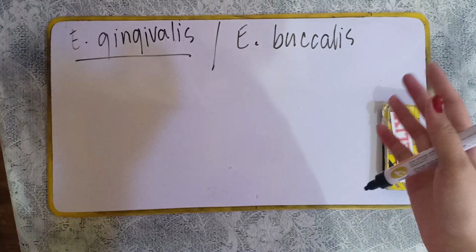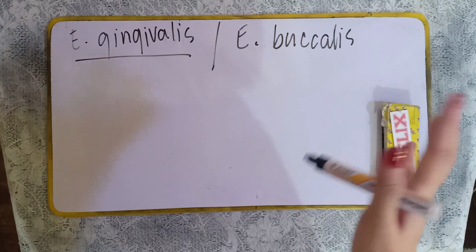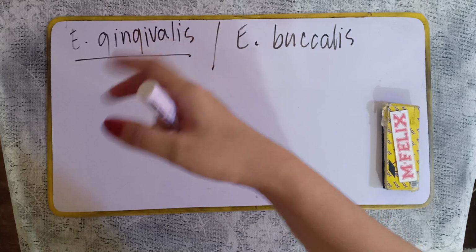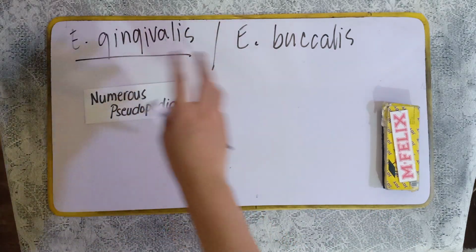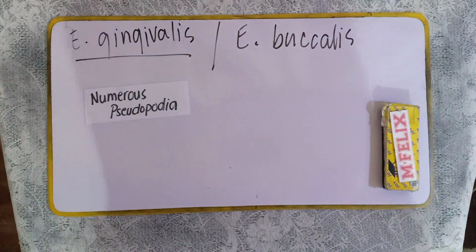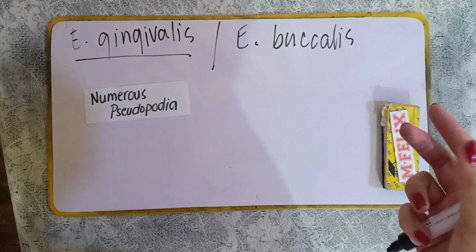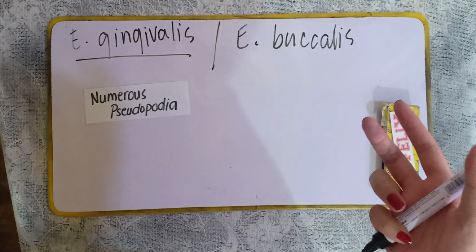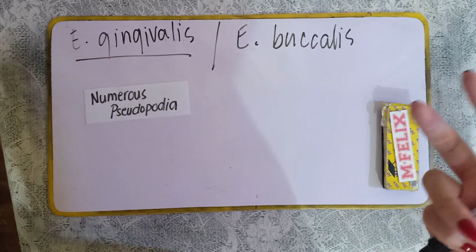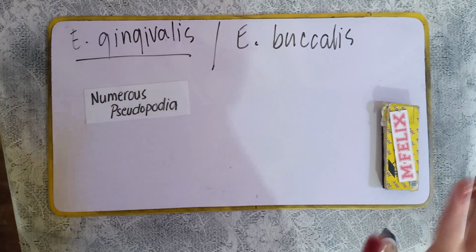Now, they are abundant in cases of oral diseases, obviously, and it moves quickly. Very progressive ang kanyang motility due to its numerous pseudopodia. It has numerous blunt pseudopodia, enabling them to move very quickly. Now, the food vacuoles that contain cellular debris and bacteria are numerous. The cytoplasm of the trophozoite contains cellular debris and bacteria. Napakarami, so dirty looking din yung kanyang cytoplasm.